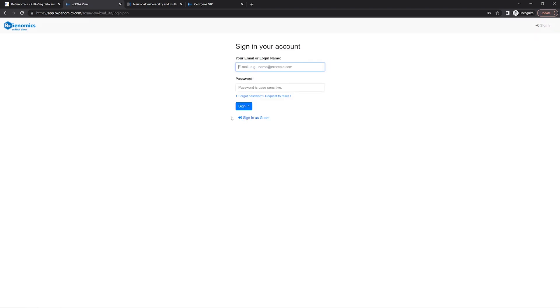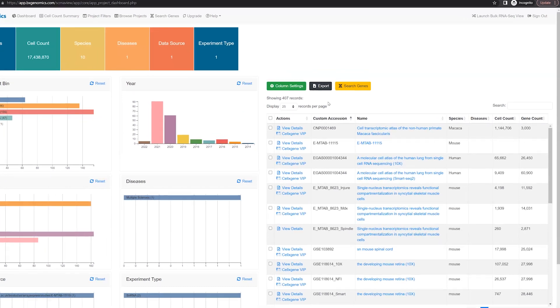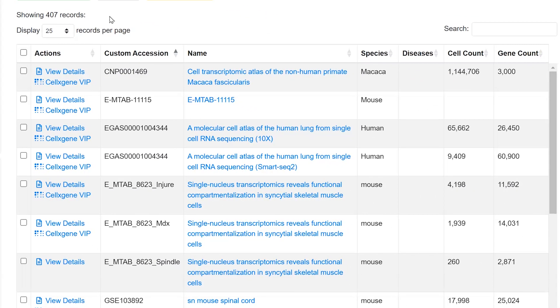We highly recommend that you create your own free account so you can save your results. But for the demo, we'll just sign in as guests. Within the scRNA view system, we have already preloaded over 400 single-cell RNA-seq datasets.